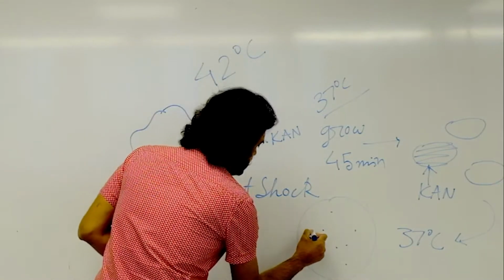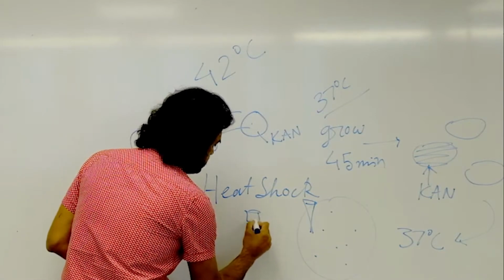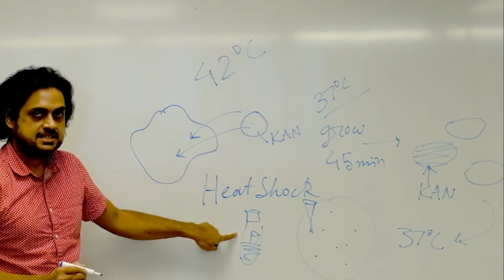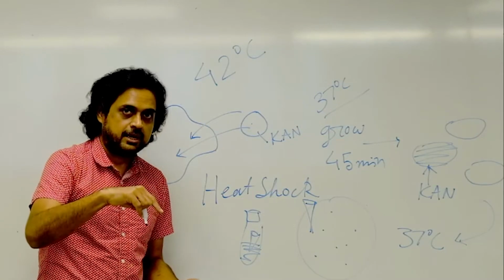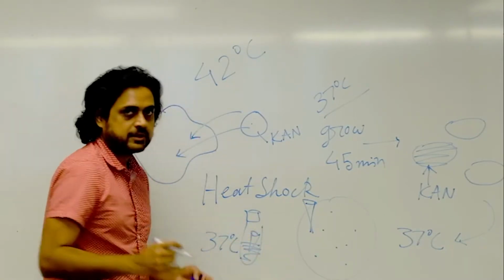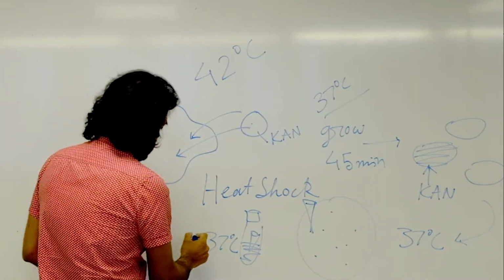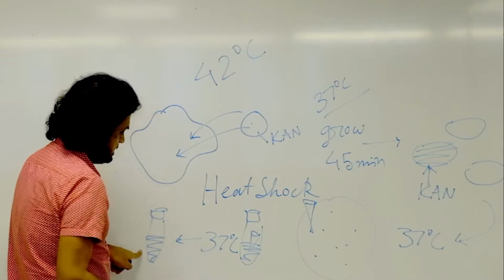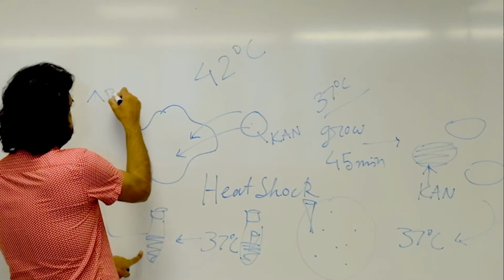So what you do is you take a sterile pipette tip or sterile toothpick and then you pick up the colonies. And you grow the colonies in an LB broth media, again with antibiotics. You grow it at 37 degrees centigrade overnight. And on the second day when you come back, you will have these cloudy cultures of E. coli cells. With these E. coli cells, what you need to do is a plasmid extraction.